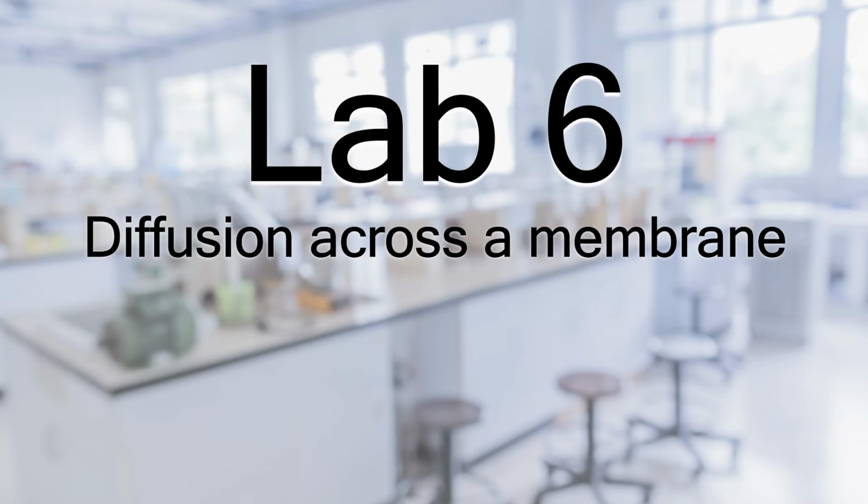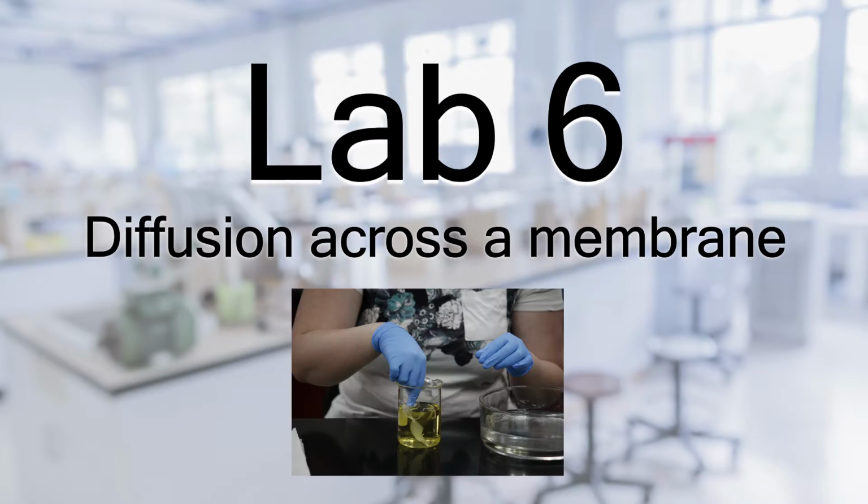Lab 6, diffusion across a membrane. In lab, we will be measuring diffusion across a selectively permeable membrane over time. You will need to properly set up the experiment in order to collect useful data.